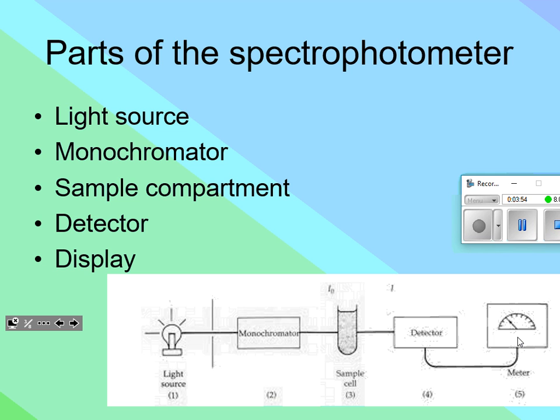Now, perhaps when you were at the lab bench, you noticed we have these tiny little test tubes. They're actually called cuvettes. This is what will go inside this compartment right here. So again, there's not a lot to this machine. There's a spot there you put a small test tube in with a solution, and then there's a dial that you can adjust the frequency for. That's this part right here. Again, that's how we can adjust what wavelength we get through. I will say that that test tube fits in snug, really snug. So I might need someone with smaller fingers to take it in and take it out to prevent breaking this, which I've had happen before.